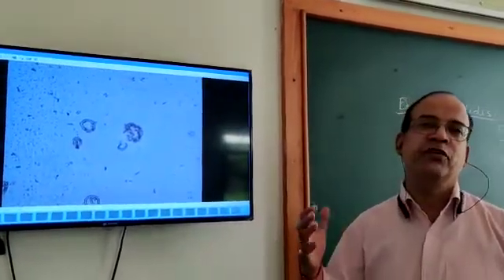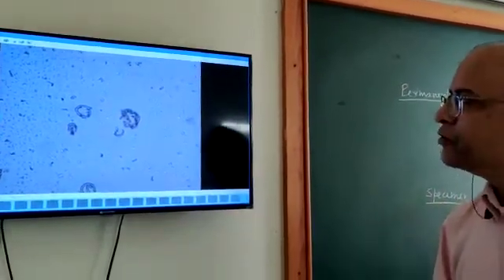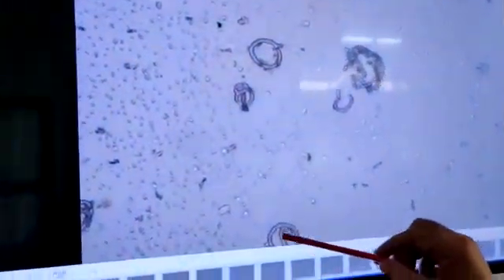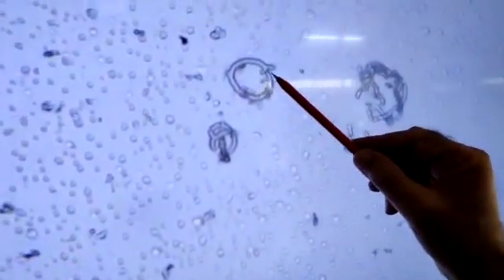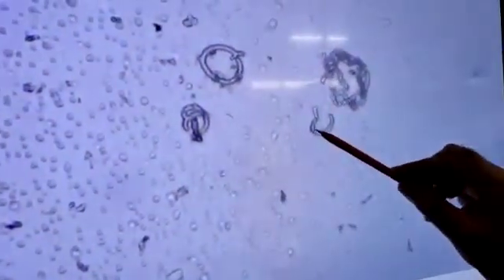Ringworm causes infection on the scalp and causes itching. This fungus is Microsporum. You can see this is the mycelium of Microsporum. You can see the reproductive structures — these round structures are conidia. Here you can see the formation of conidia coming out in chains. All these conidia get separated and develop into new mycelium. So this is Microsporum, commonly called ringworm.